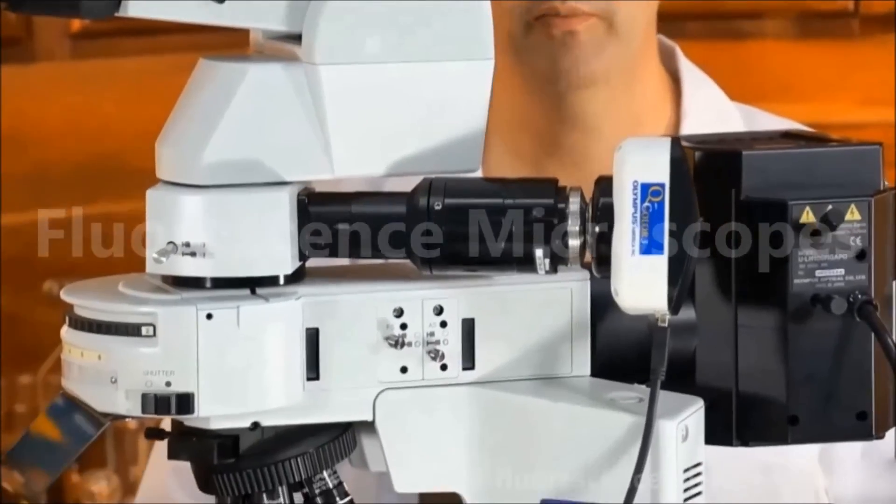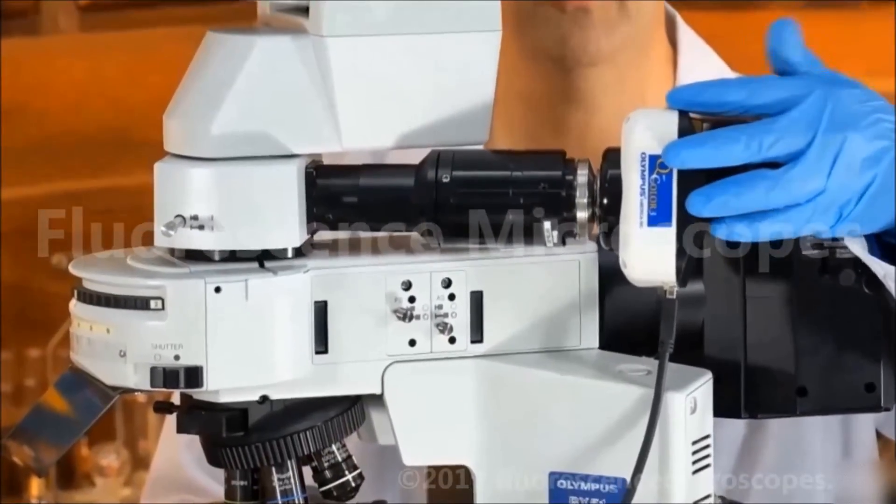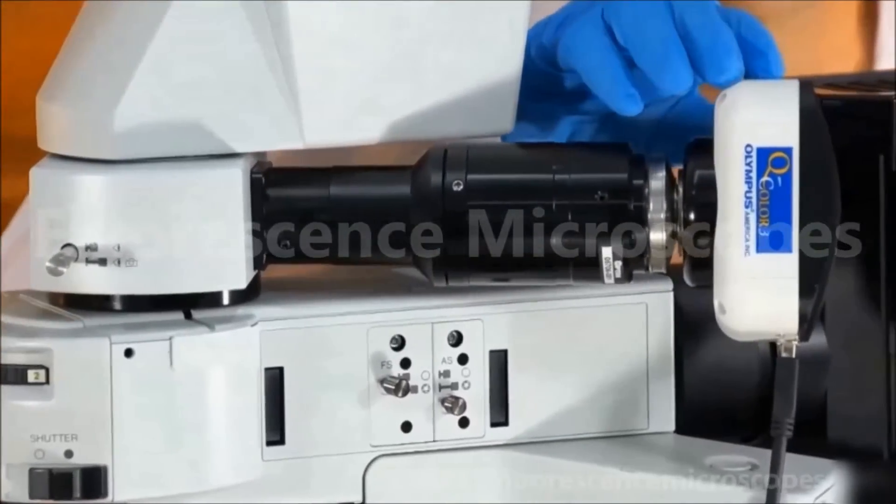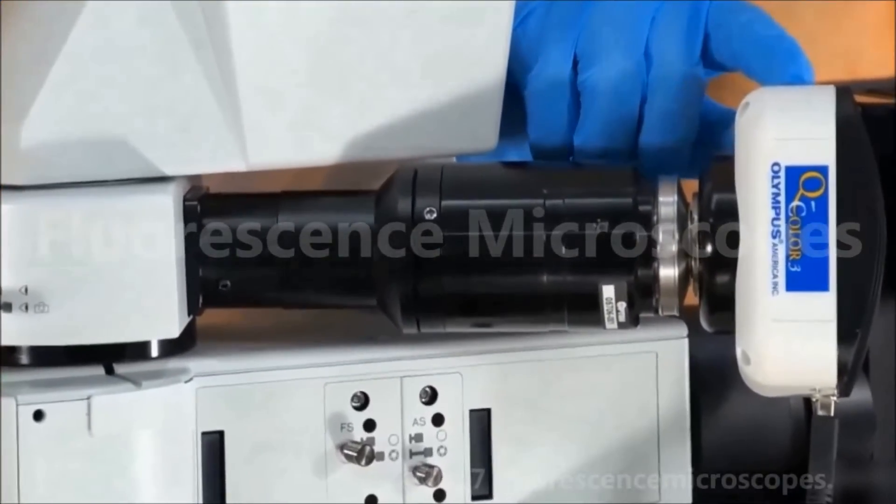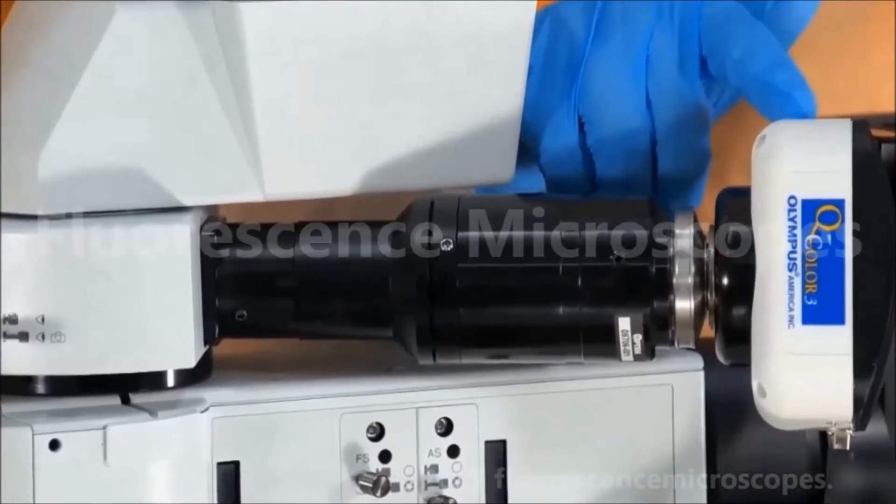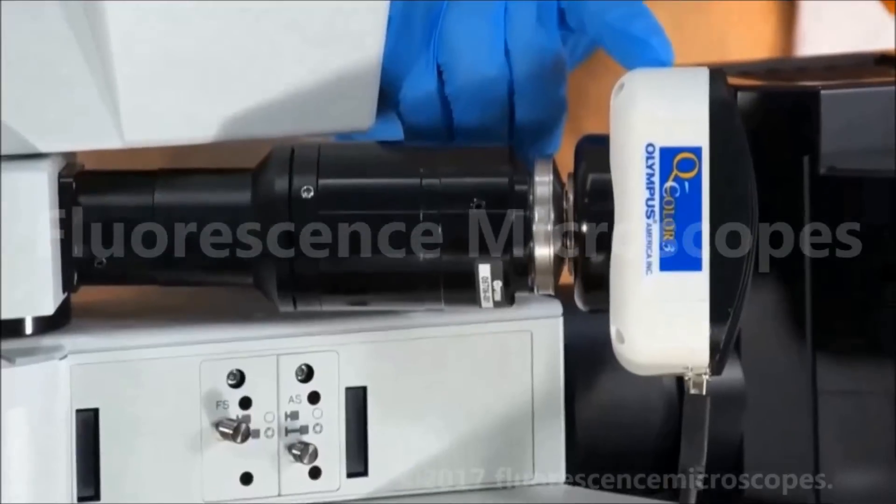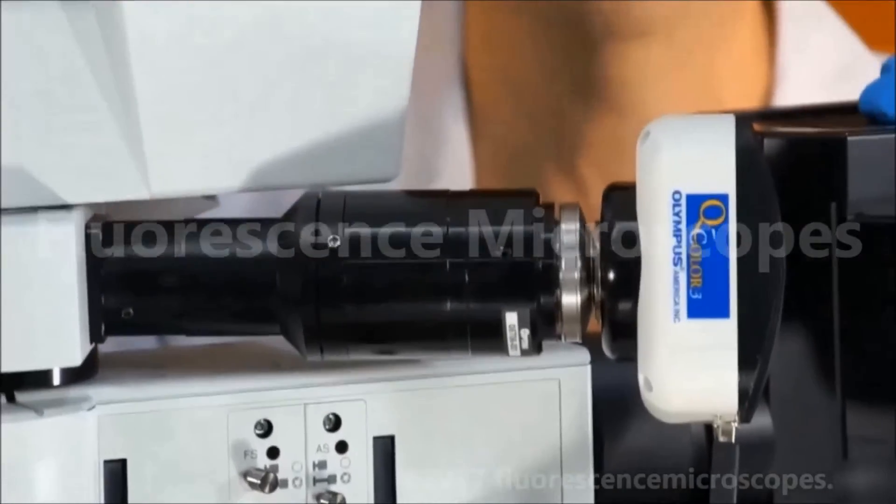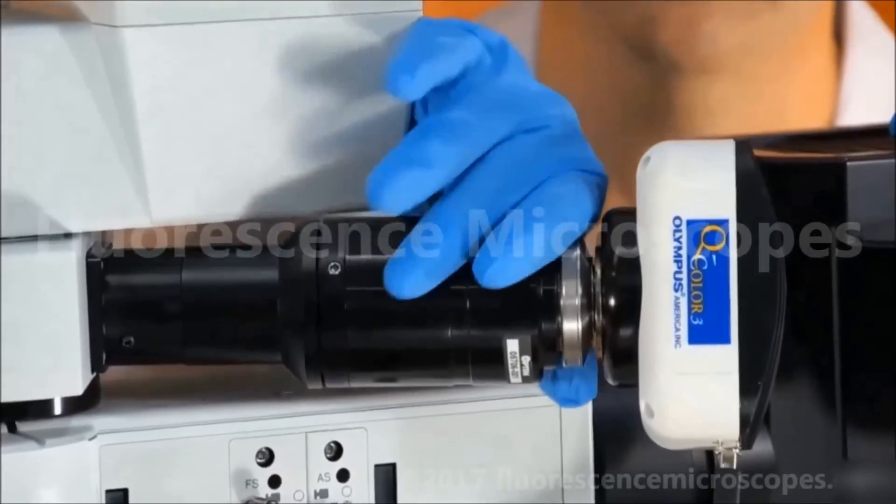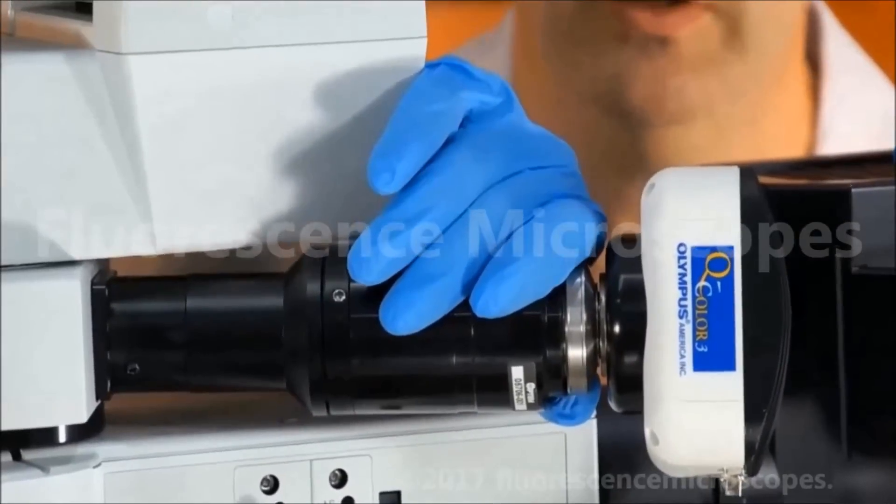We've also configured this microscope system to have a camera, as well as a seam mount. This camera may or may not be included. You'll need to look at the specifications on the ad to see if we include a camera or not. But the bottom line is that this system is capable of taking photographs with this included seam mount adapter.